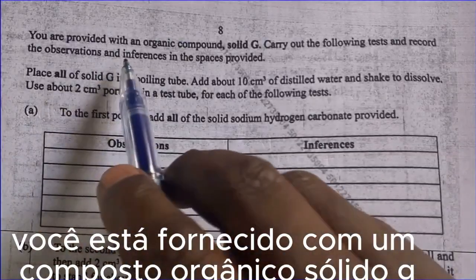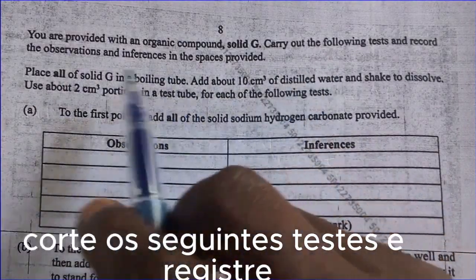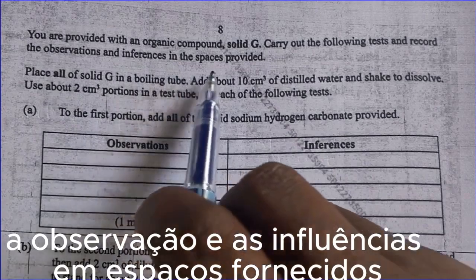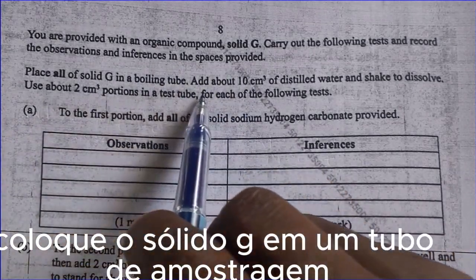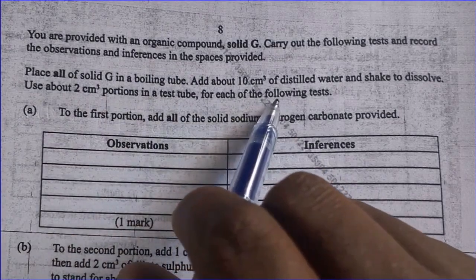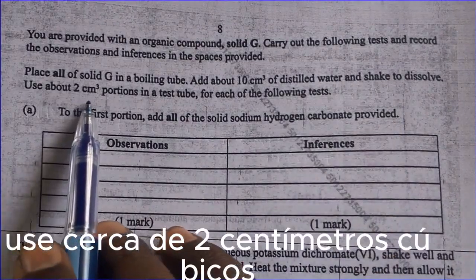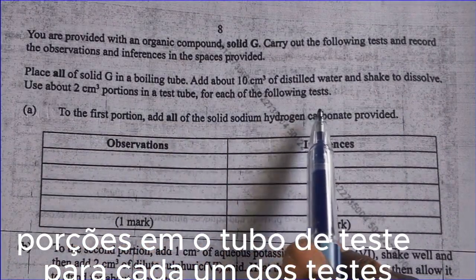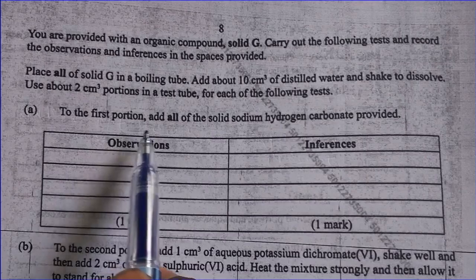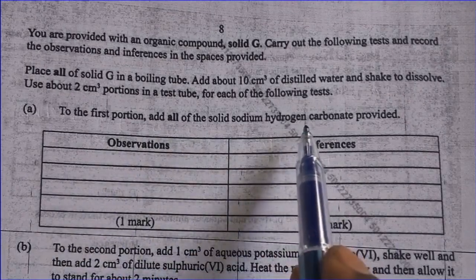You are provided with an organic compound solid G. Carry out the following tests and record the observation and inferences in the spaces provided. Place all solid G in a boiling tube, add 10 centimeters cube of distilled water, and shake to dissolve. Use about 2 centimeters cube portions in the test tube for each of the following tests. To the first portion, add all of the solid sodium hydrogen carbonate provided.